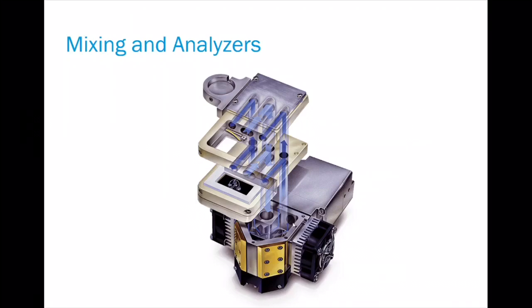If you look at your chamber installed on your instrument and open it up, you will likely be able to see those three holes as well as this air channel at the back that allows for this mixing. Very, very efficient, very high boundary layer conductance with this design.